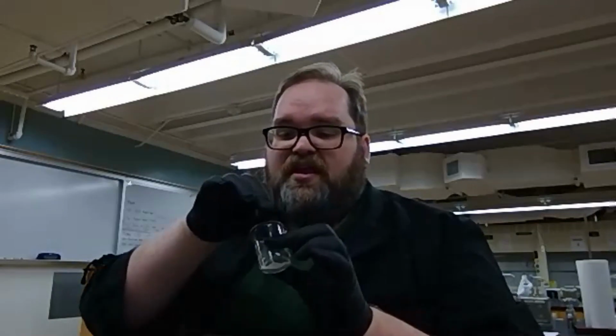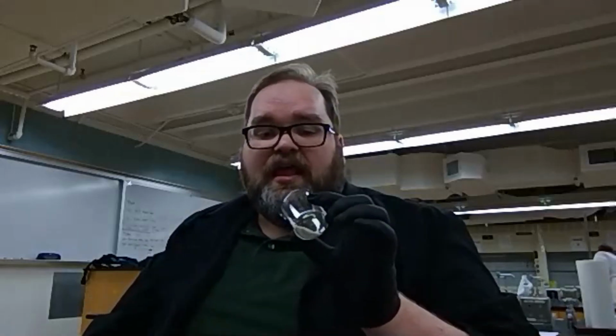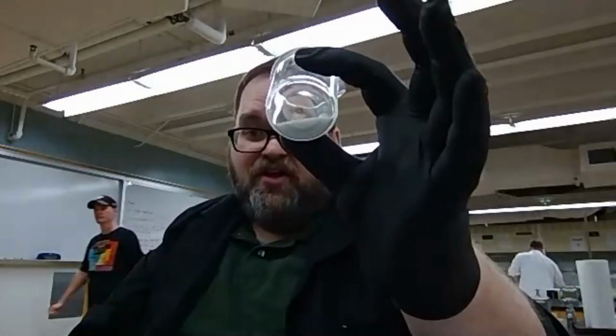So today, we're going to take a mixture of sand and salt, which is what I've got in here. Pure sand and salt, table salt, so sodium chloride, and just sand from out at a beach, except clean because we buy it. We want to figure out how much of this is sand and how much of this sample is salt. Percent by weight, so that means we want the mass of the salt divided by the mass of the mixture and the mass of the sand divided by the mass of the mixture times 100, okay?